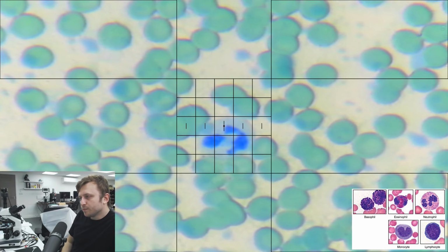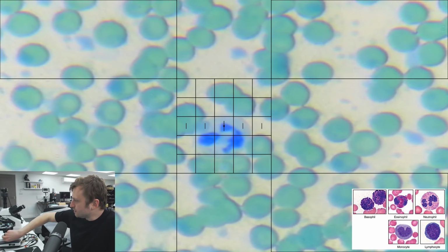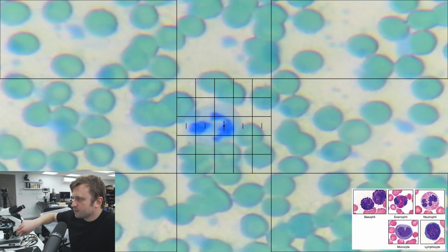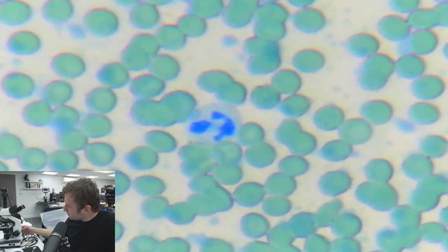I don't have immersion oil for that lens, but I do sometimes use hyaluronic acid as a substitute. However, I don't want to risk it leaking onto the slide, even though it has been fixated, but I have a feeling it will ruin the subject. I don't really want to do that. Let me turn off the overlays, and there we can get a clearer view of it. But I can still do the 100 without the immersion. It will just be not as clear as you want it to be.